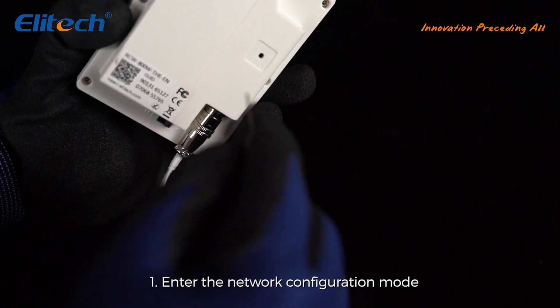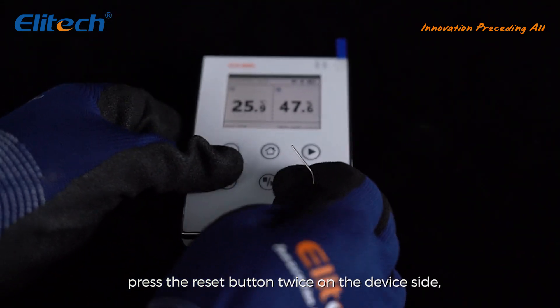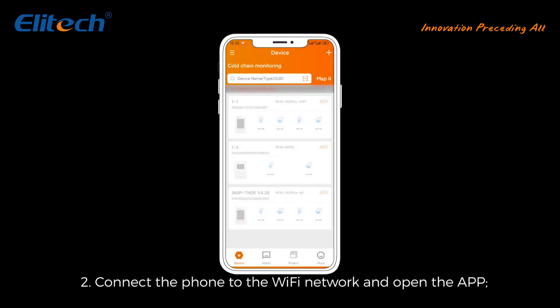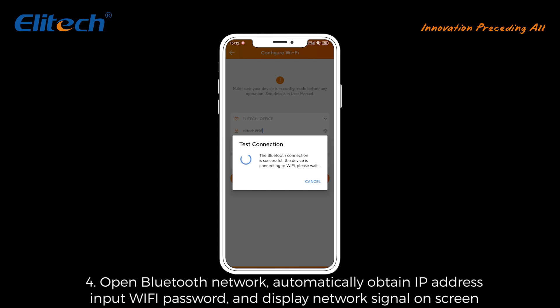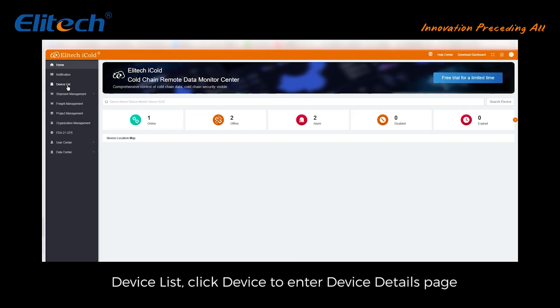Method 2 - Bluetooth network distribution: press the reset button twice on the device; the Bluetooth network configuration icon will appear on the device interface. Connect the phone to the Wi-Fi network and open the app. Click the device to enter the device details page, click the Wi-Fi configuration button, open Bluetooth network, automatically obtain IP address, input Wi-Fi password, and the network signal will display on screen.